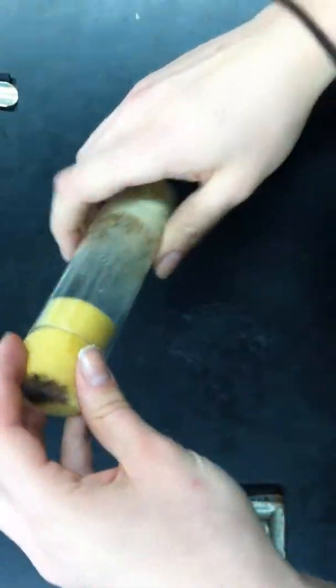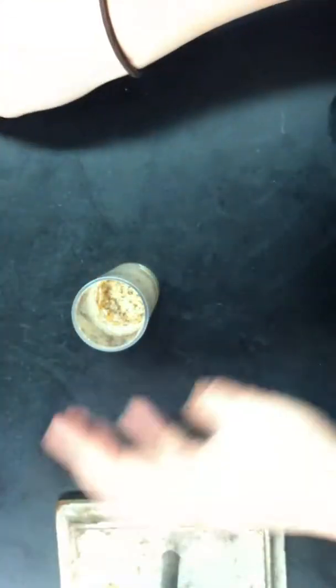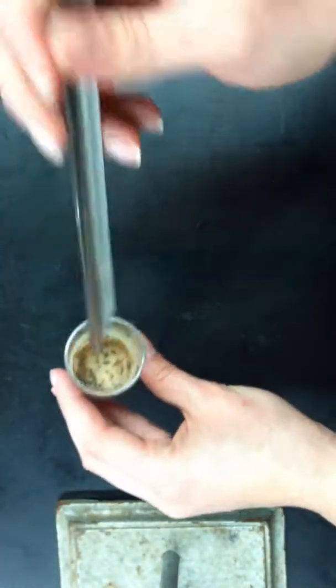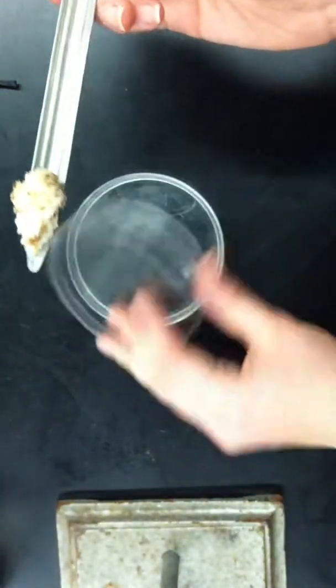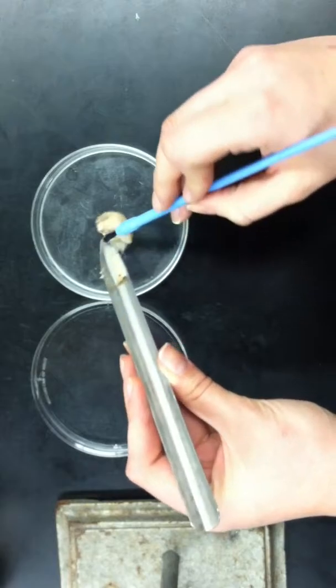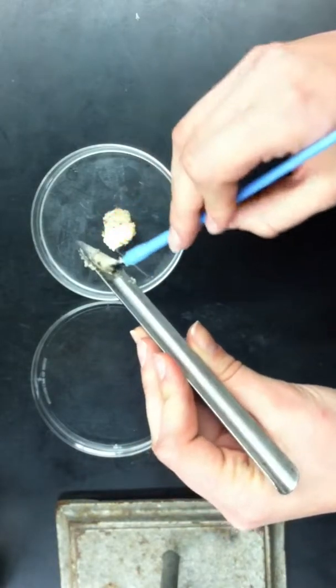So first, you're going to open the vial. And with the scoop, scoop out some of the media. Then you take the Petri plate, and with the thicker side of the Petri plate, you can use the paintbrush to help you. Just put the media in a clump in the center.